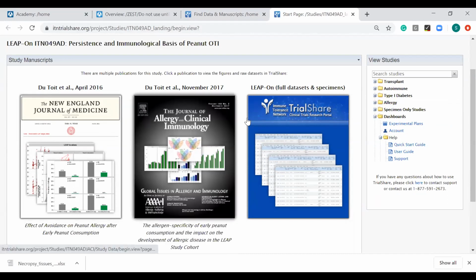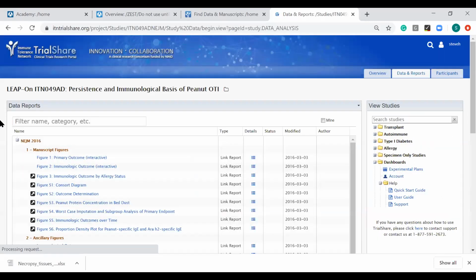And there's a number of different journals or different actual publications that are on top of this data. I think this one is a particularly interesting one. It's about peanut allergies, and they've challenged their subjects with peanut proteins to see their reactions.